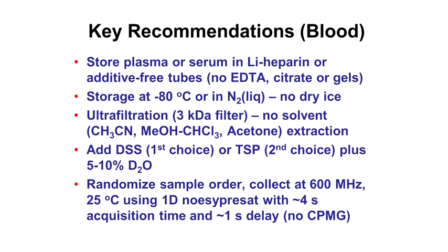Storing plasma or serum, so it's not blood. You never analyze blood. But store them in additive-free tubes, if possible. That means you don't want to have organics like EDTA or citrate, because that makes it very, very difficult to deconvolute things with NMR. Store at minus 80, no dry ice. To get rid of the lipoproteins, which cause a lot of problems, signal broadening, you can use ultrafiltration. 3 kilodalton filters are the ones that are recommended.